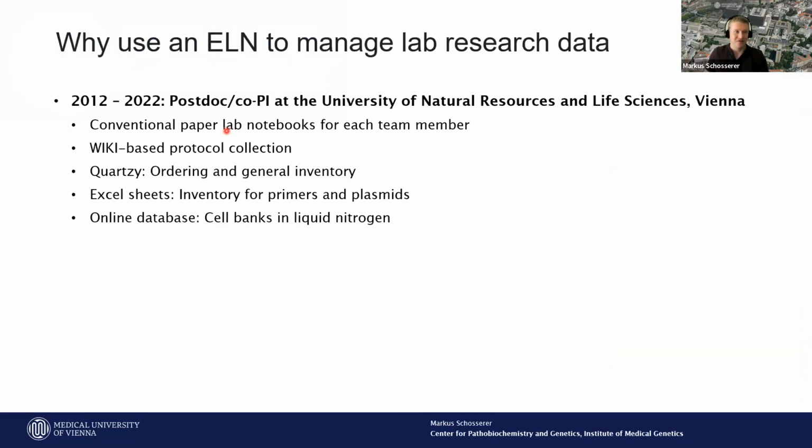The idea to use an ELN already came up during my time before I got my independent group leader position. From 2012 to 2022, I was a postdoc and also co-PI at a different university in Vienna. There we used many different ways of documenting our data. Of course, we used conventional paper lab notebooks for each team member. For PhD students, this accumulated to 8 to 9 paper notebooks during their scientific career.